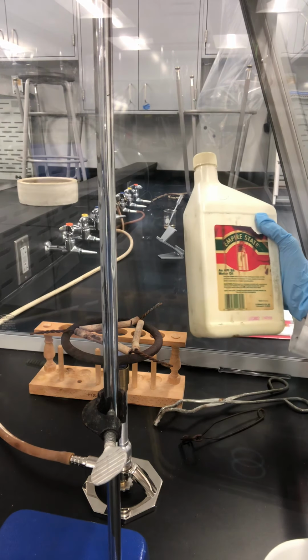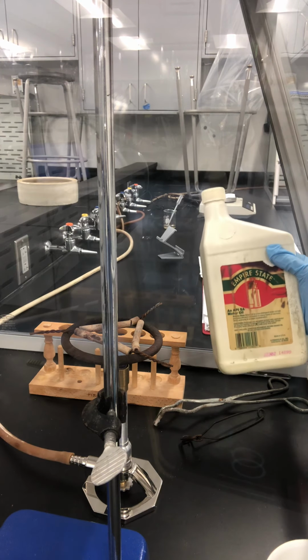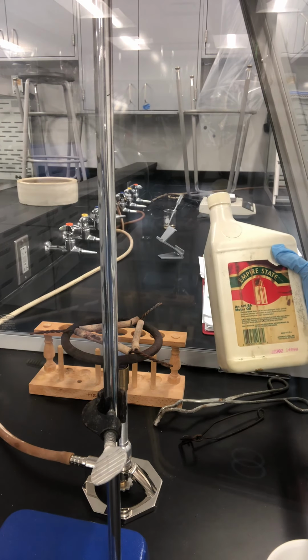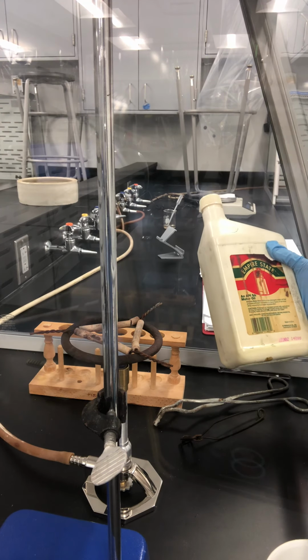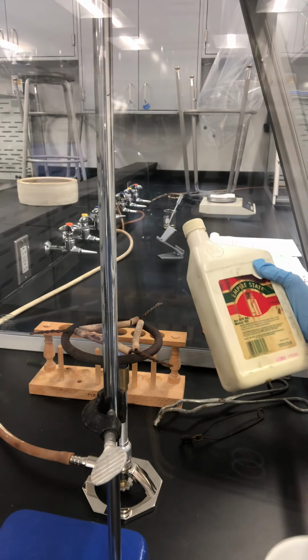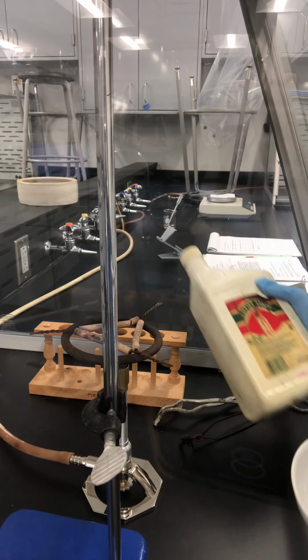The lubricant oil I use is SA oil. We already learned what SA means. S is spark ignition engine. A is the designation of the oil. This is the lowest grade of oil. We already learned that in the lecture. And I'm gonna dump some of the oil into the evaporating dish, about 10 grams.